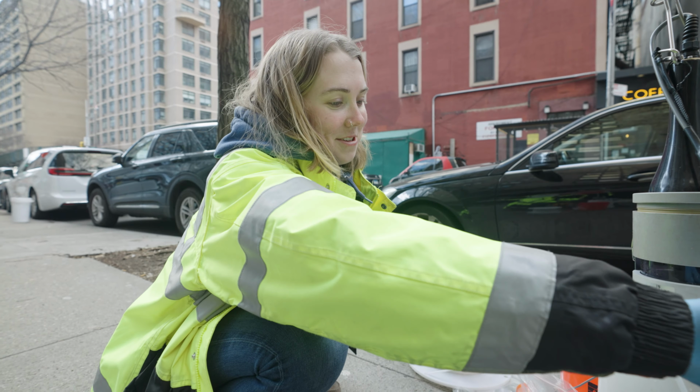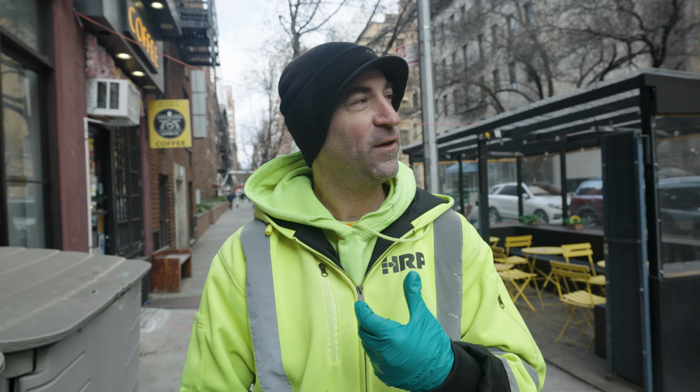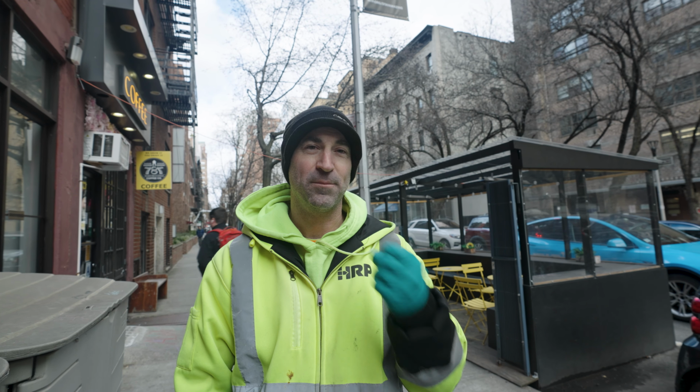It does kind of stink to do this in the cold. When we're working out here in the cold weather, today's not too bad, but if you're working in very cold weather, 10, 15 degrees, you have to be careful of your meters. The pH bulbs and the ORP bulbs are liquid filled. So in between sampling, if it's a little while before you get to your next well, put your meter in the truck and keep it warm, because you don't want those pH and ORP bulbs to burst. Then your sensors are garbage and you're not going to get any proper readings. They're going to be all wrong.